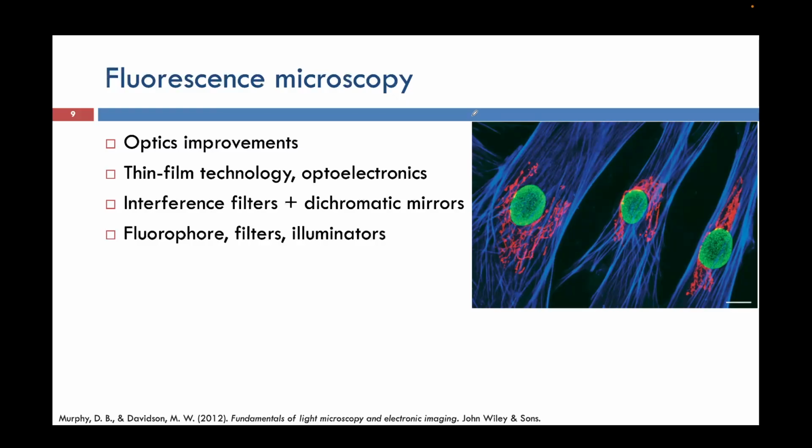Now we will come to the last segment of our microscopy, that is fluorescence microscopy. We will see how fluorescence microscopy works. Before that, I just want you to look at this picture here. In this picture you can see some bright lights coming from this section. Some blue lights are coming from here, this is green light, then this is red light. So we can see some bright colors. This colorful image we can get through fluorescence microscopy.